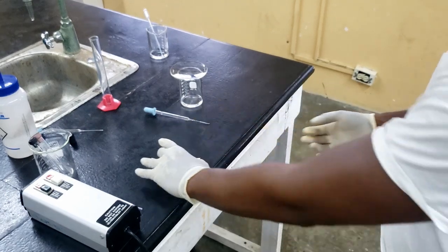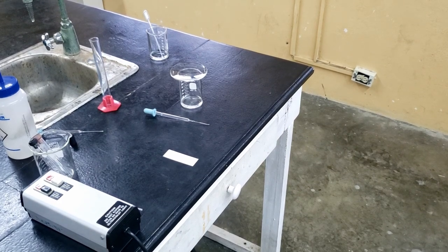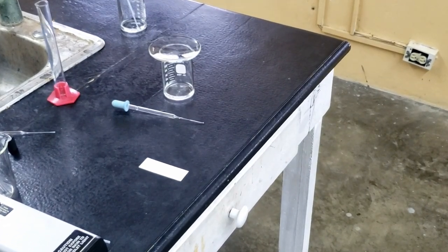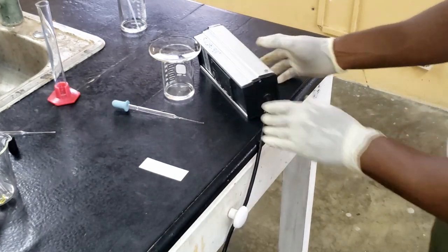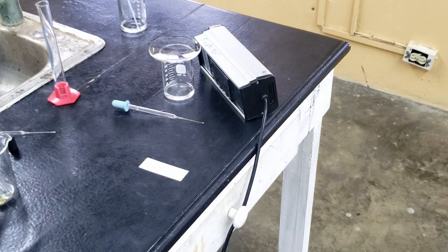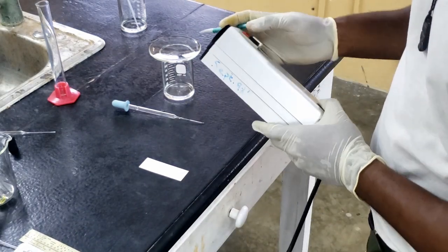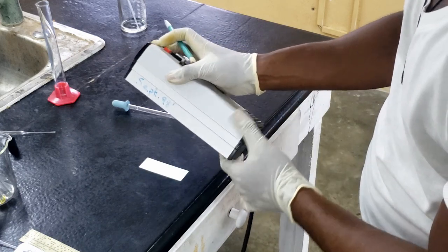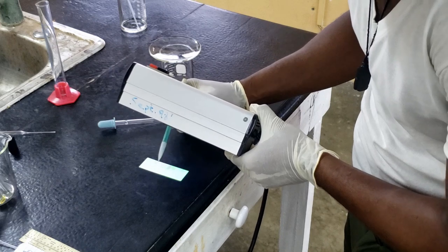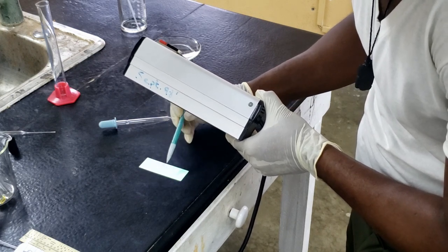We can now look at the TLC plate under the UV lamp. So I'll just get in a bit closer. So we're going to observe under shortwave UV and see where those products ended up. I'll just take a pencil and outline and circle any other products because it might be a bit difficult for you to see on camera. So we ended at about half a centimeter from the top.